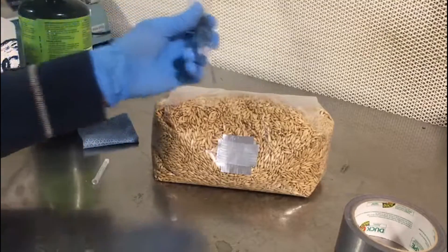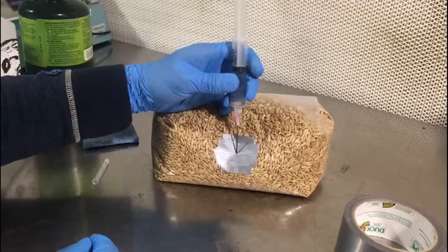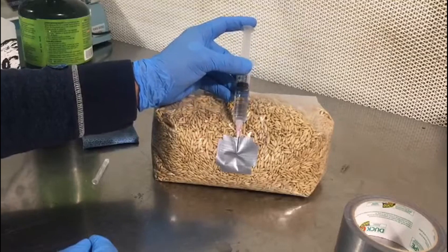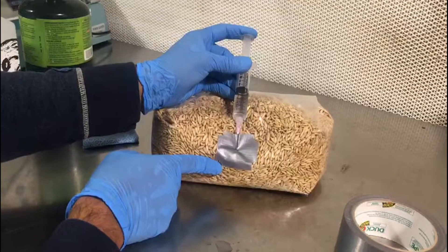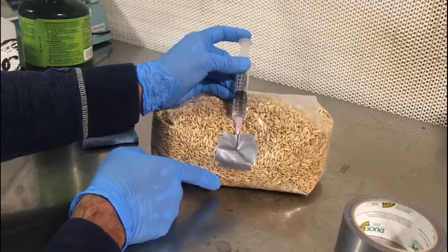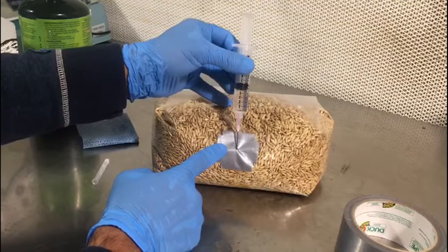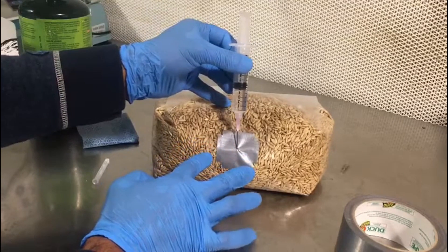Once your needle has cooled, we will inject the bag through the tape layers we just created. Also a tip: whenever you are injecting fluid into a grain bag, try to inject the liquid nearest to the plastic so that you can visibly see the fluid drip into the grains. Immediately after removing the syringe and needle, we will apply a fourth layer of tape to ensure that this stays as sterile as possible.